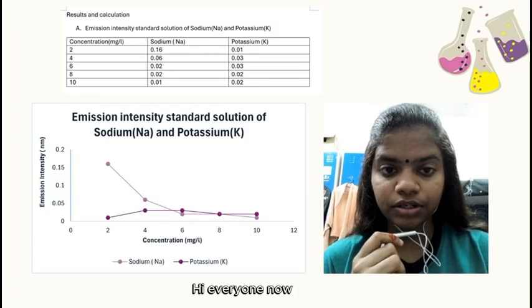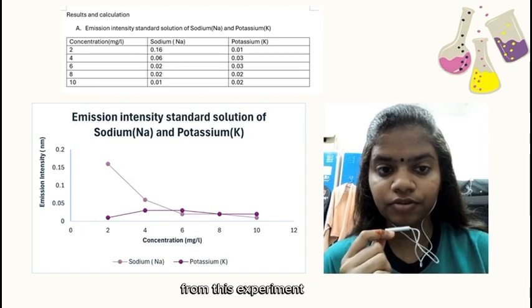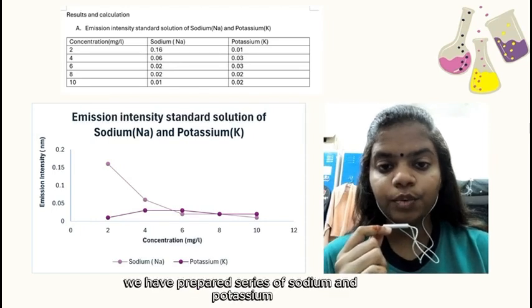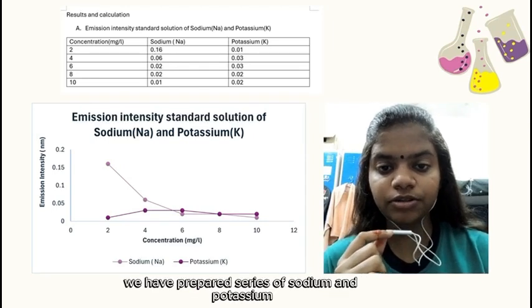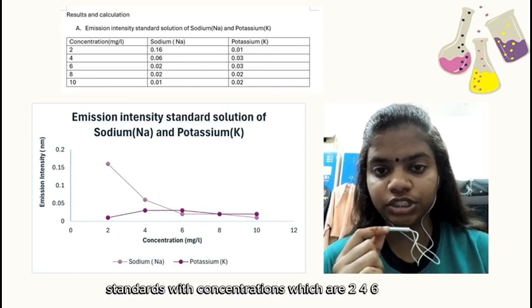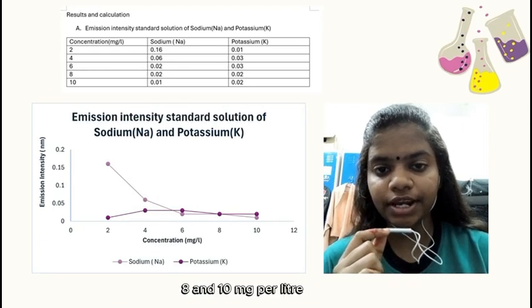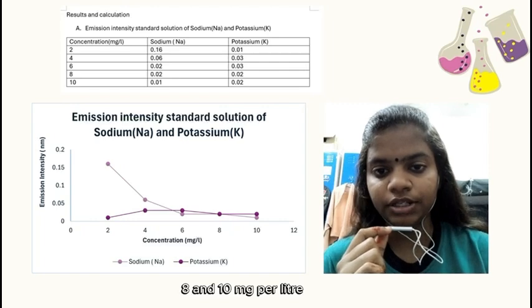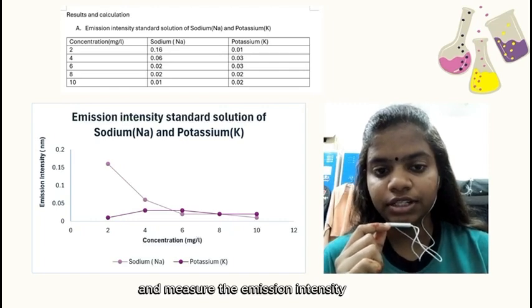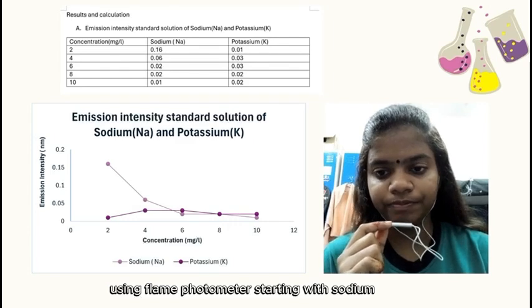Hi everyone. Now I will explain the results obtained from this experiment. We have prepared a series of sodium and potassium standards with concentrations of 2, 4, 6, 8 and 10 mg per liter and measured their emission intensity using the flame photometer.